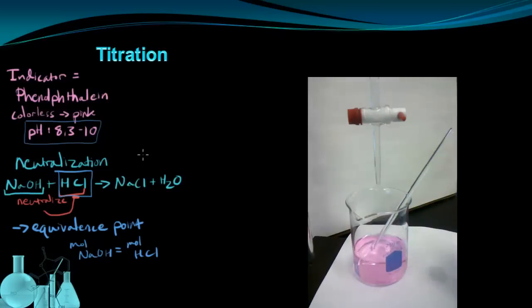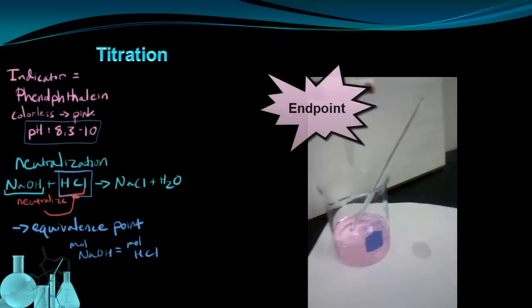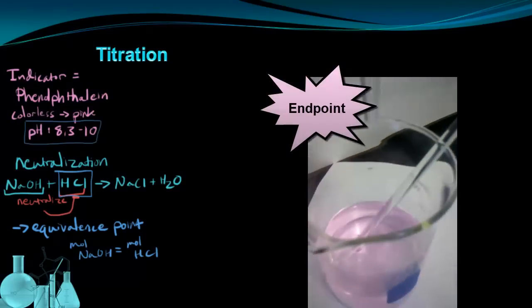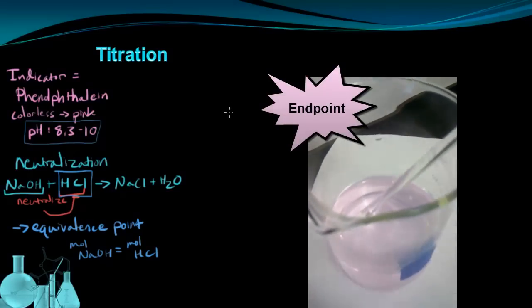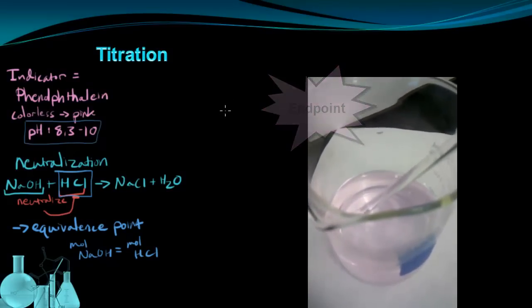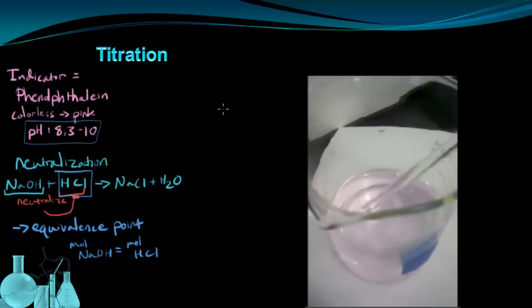So here you can see that we've reached a slight permanent color change we're looking for. The phenolphthalein is now showing up as a light pink in the solution. We call this the end point of titration. This is where the indicator changes color. And it's essentially our guess at where the equivalence point is. You'll notice the pH range of phenolphthalein is 8.3 to 10. It's not quite pH 7.